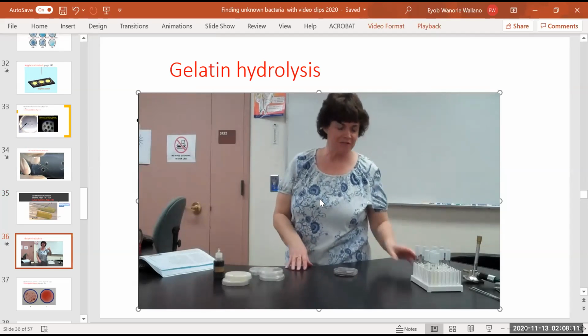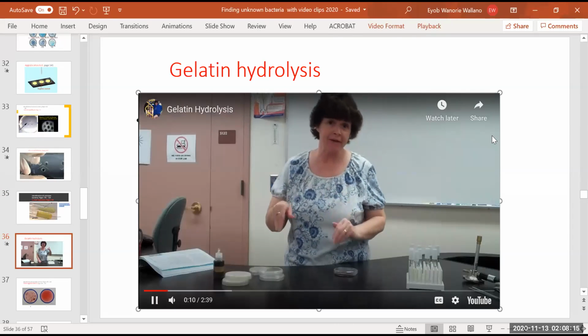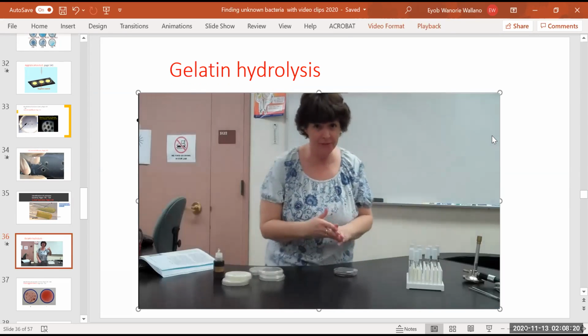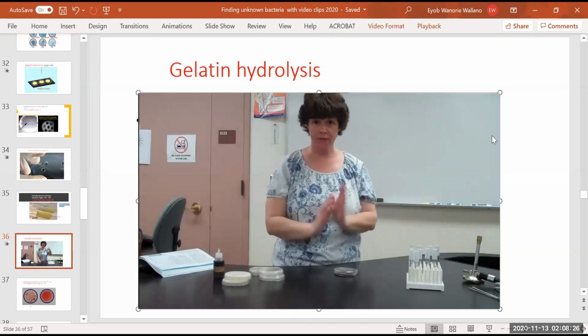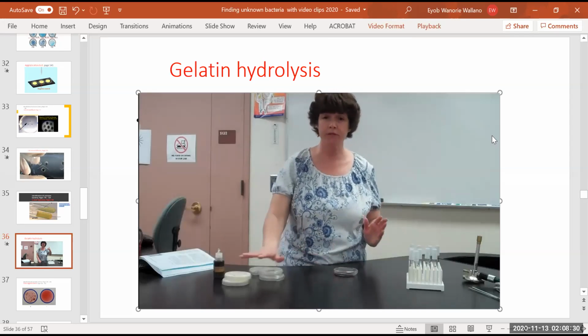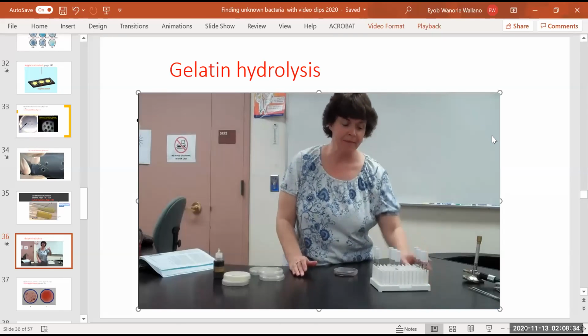Okay, in the last video, I forgot to mention one thing that I wanted to just do right now. So this is going to be a little add-on. It's going to be posted separately, but just go look. It'll be there with the rest of the videos. This one is the gelatin results. I told you for all of the plates that you're looking for that zone of clearing as a positive result. The starch you had added the iodine, but the rest of them were just the plate itself. I forgot to mention the gelatin.